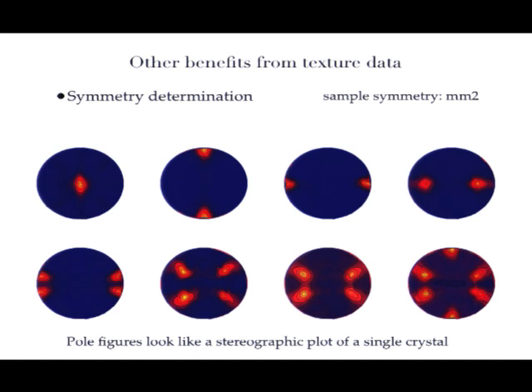So that's what we see here. And the crystals themselves are actually triclinic. You can see, not very easily, that this one is not 90 degrees from this position here. So careful analysis shows that it is really triclinic.